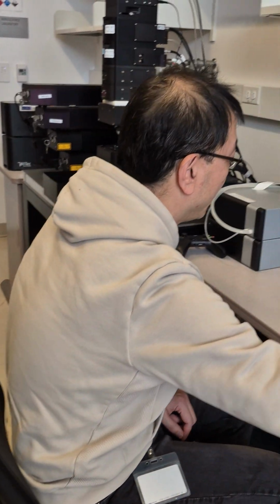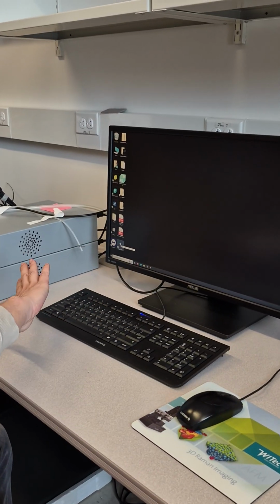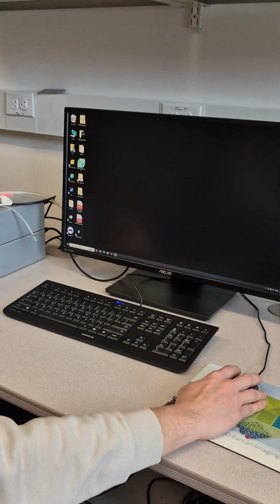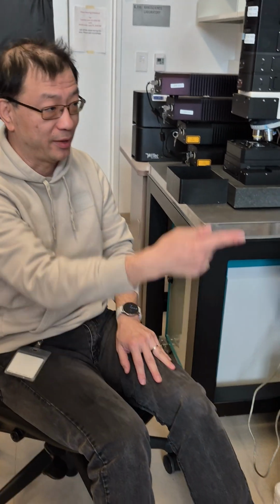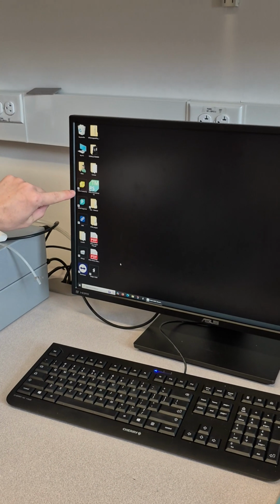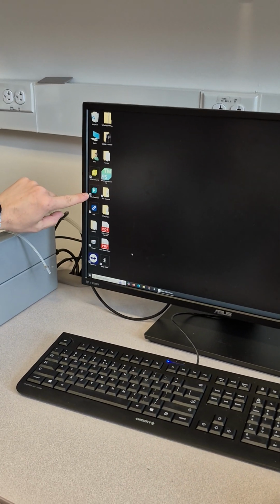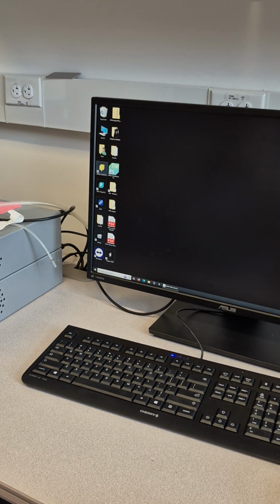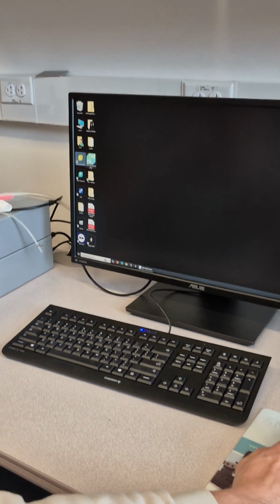The badger is installed here. So once you start a computer, at any time, you just start the badger, log in, and enable it. Okay, log in now. We'll do the control 6. This is a user interface. Project 6 is data processing. So you find the control 6, you double click it, and it will start.